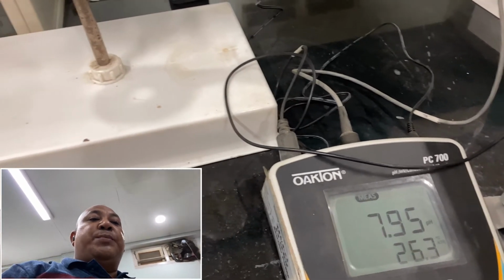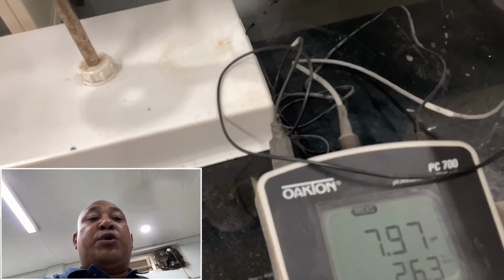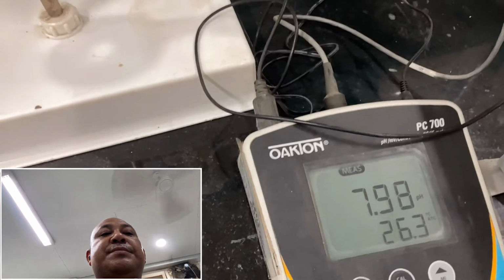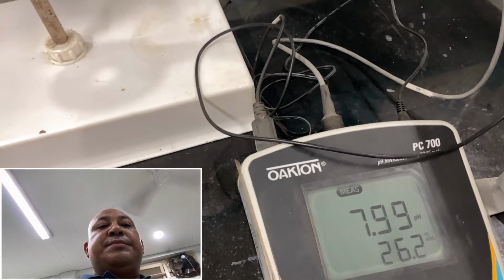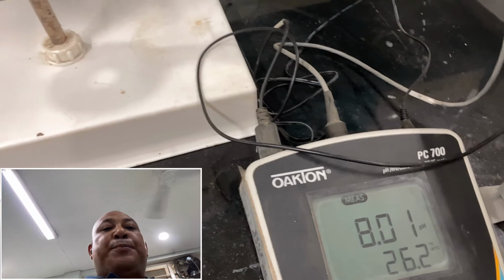So we'll check by turning the fan off, please. Now it's 7.97, coming very close to 8. 8.01.